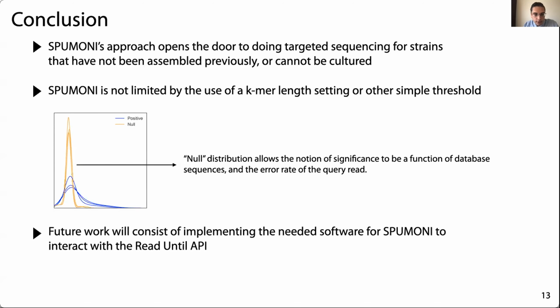And future work will consist of implementing the needed software for SPUMONI to actually interact with the read until API directly to actually perform the targeted sequencing.